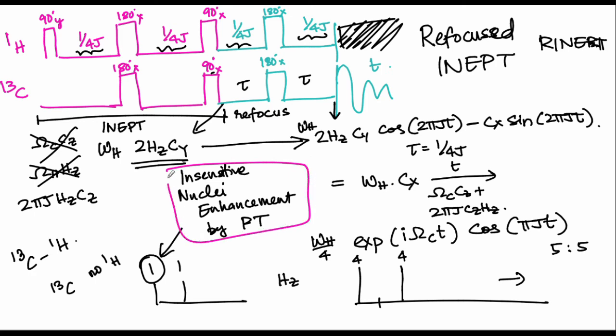However, the INEPT module forms an integral scheme in almost any NMR experiment that is implemented to get heteronuclear correlations. By heteronuclear correlations, I mean 1H-13C, 1H-15N, and so on, or even 13C-15N kind of correlations are done using this INEPT module, provided they share a scalar coupling delay.